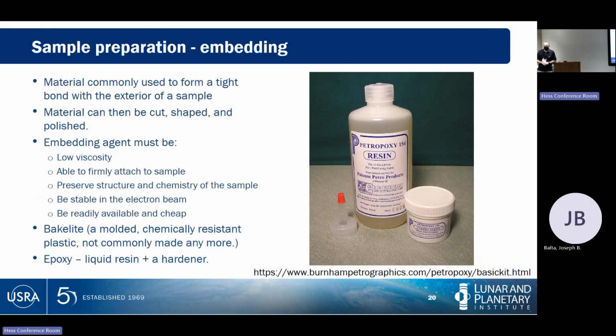Why does our lab use the epoxy that it does? And this is the answer in literally every lab I've been in. Don't anybody want to guess? The answer is somebody else bought the stuff. And it's what we have because somebody else bought the stuff.